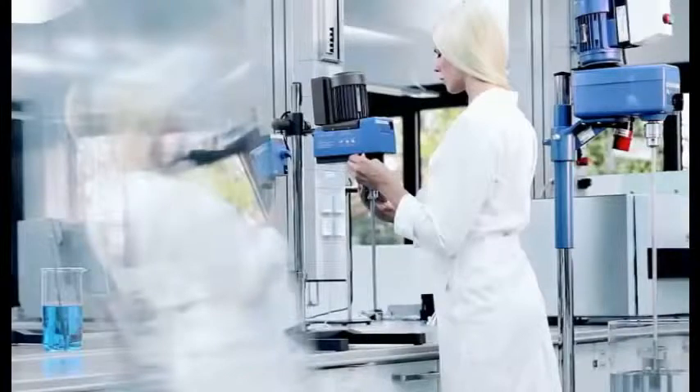Overhead stirrers from IKA. Powerful, reliable and robust.